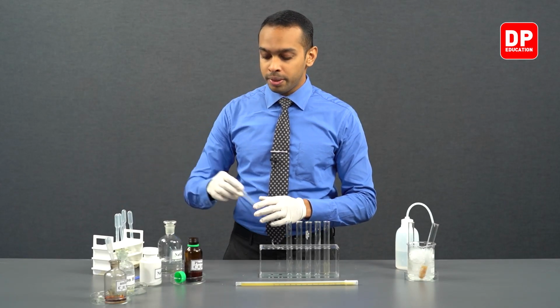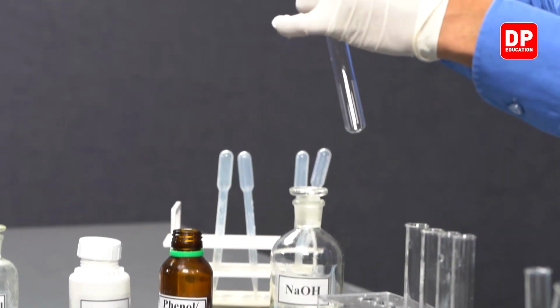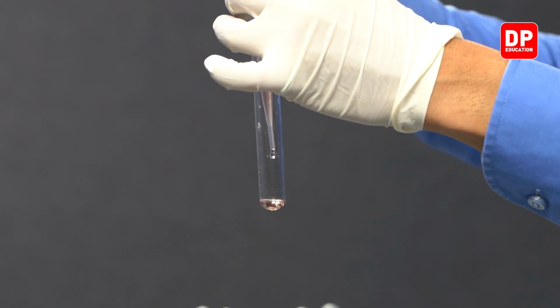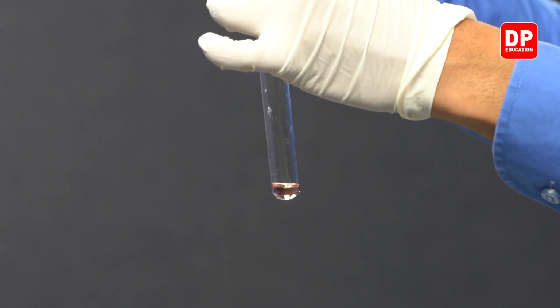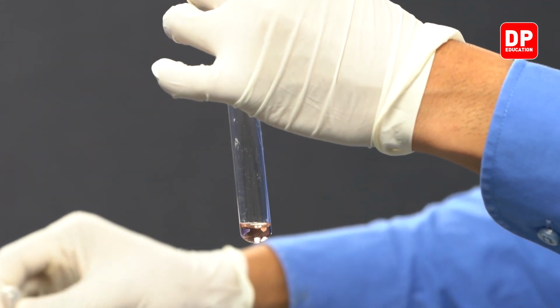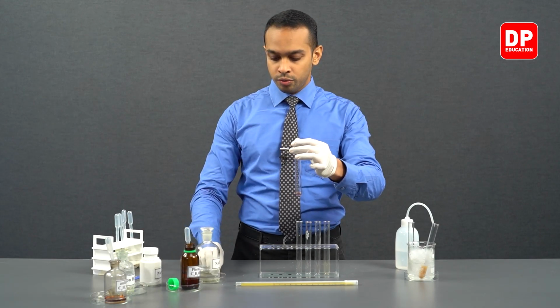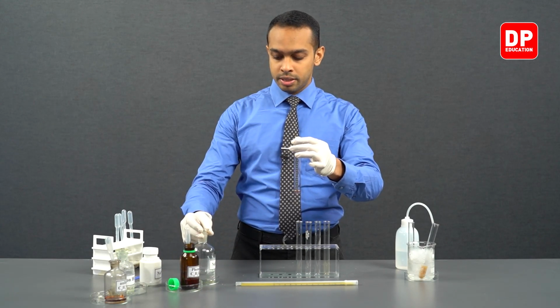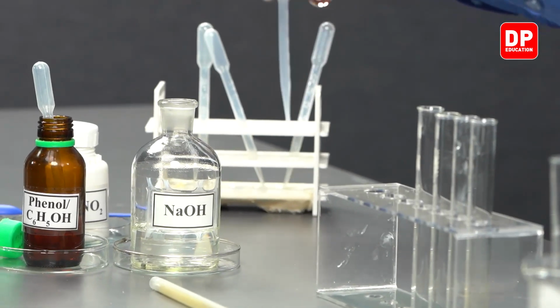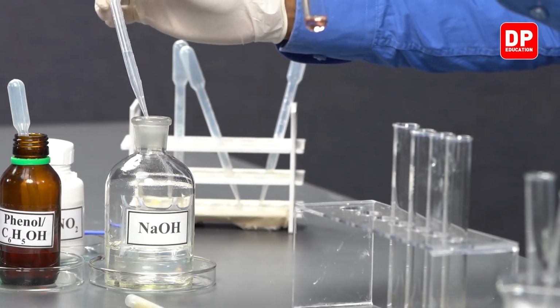Let's take a dropper and take about 0.5 milliliters of phenol. And to that, we are going to add 10% sodium hydroxide. We will be adding around 5 milliliters of 10% sodium hydroxide.